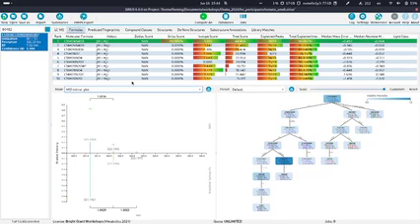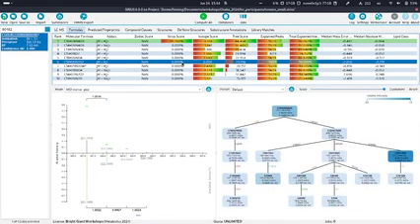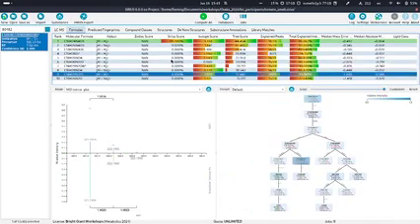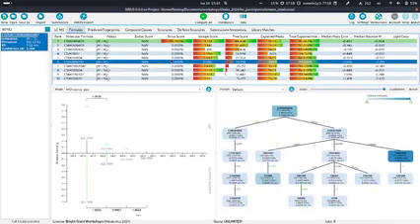We can see how well it fits. So, for example, to select a different formula, with this list of molecular formulas you can just go through it and select any other molecular formula which is not the top formula. If we just scroll through this list, we can see that it changes quite a bit depending on what we select. And this is also reflected in this isotope score.